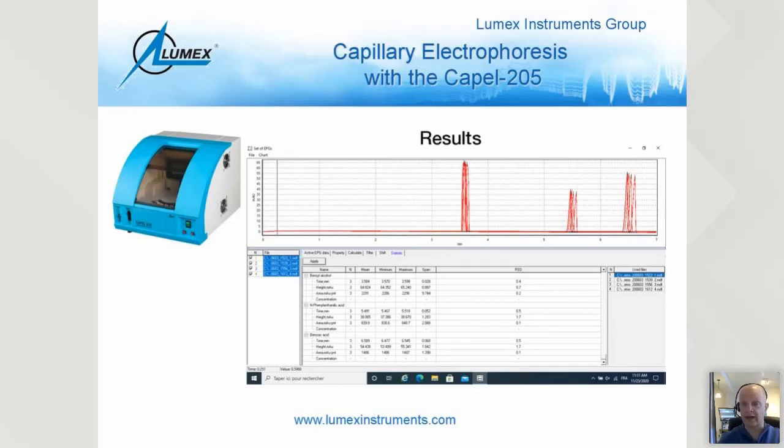It's a great tool to have for anyone that's writing a paper, or even for people that are experiencing any quality control type environment. This is definitely the tool to have on hand.